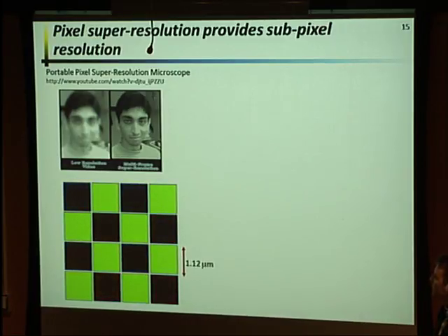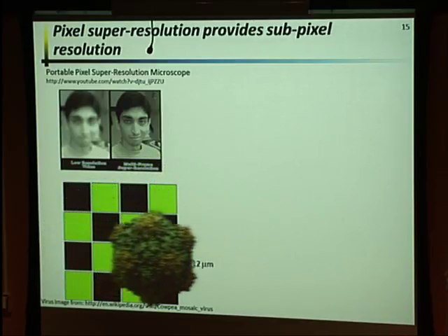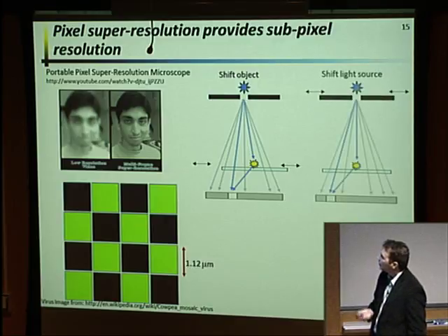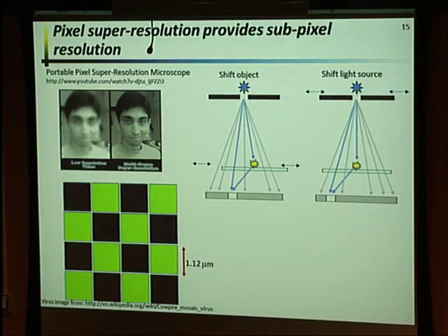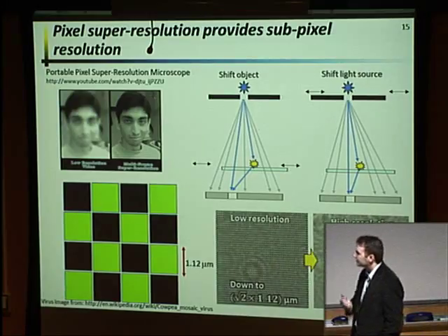We're only going to use the green pixels on our sensor. We're going to take whatever object we want. You could imagine sweeping that back and forth across the image sensor, and this would be that same sort of thing looking from the side. You can sweep your object, and in that case, your hologram is going to sweep with the object. It's a little bit more convenient to sweep the light source because the tolerances we need aren't as high, but you get the same sort of effect. You can imagine this shadow sweeping back and forth across the CCD sensor as we sweep the light source.